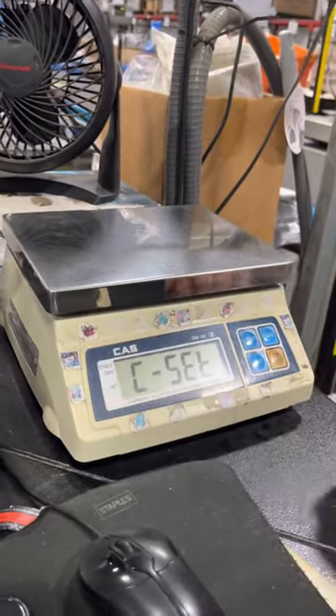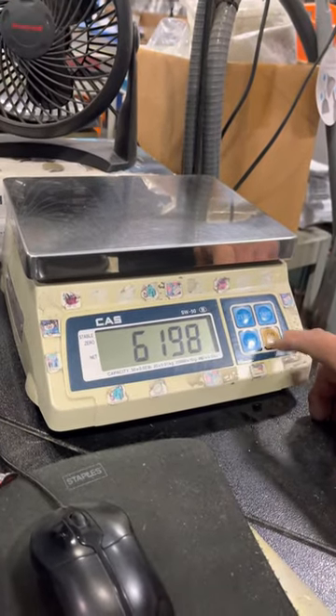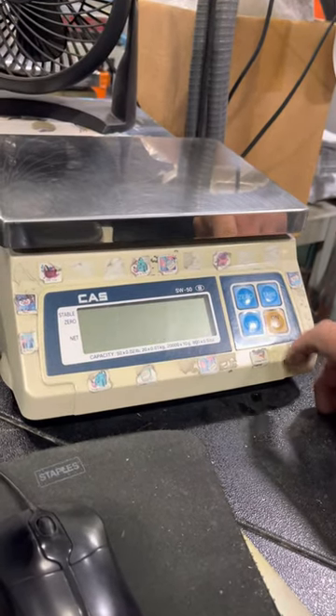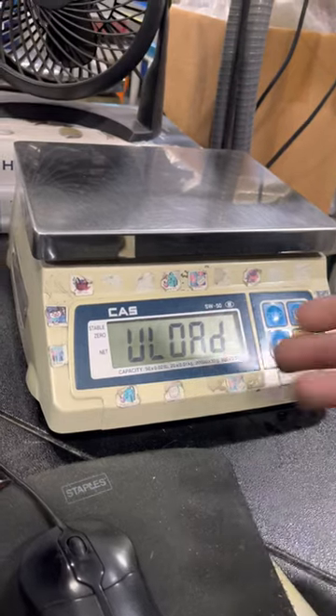Press it and you'll see 'unload,' which is a zero adjustment.